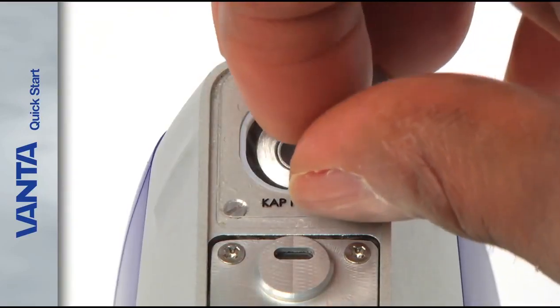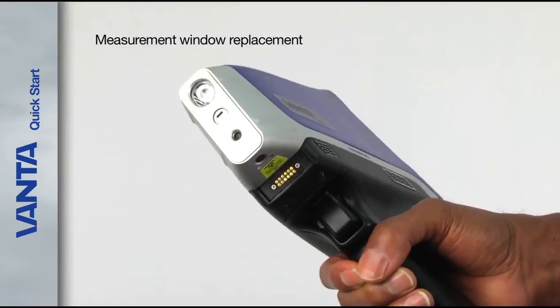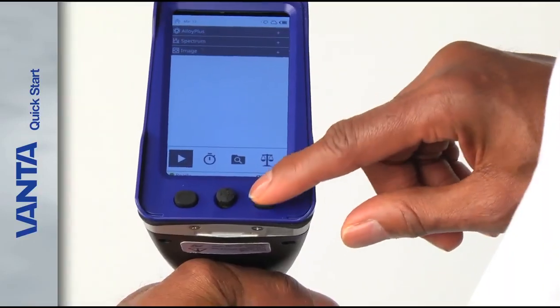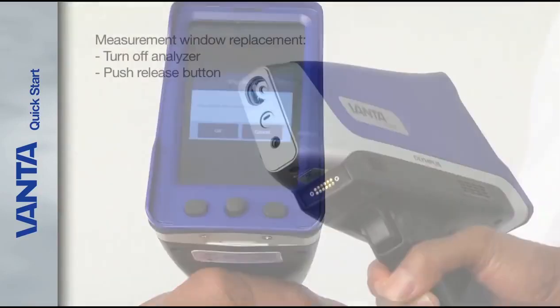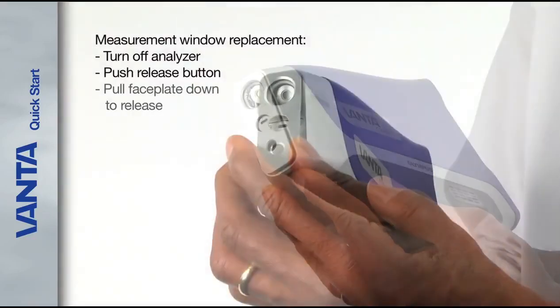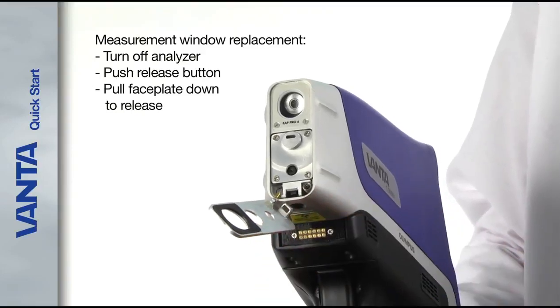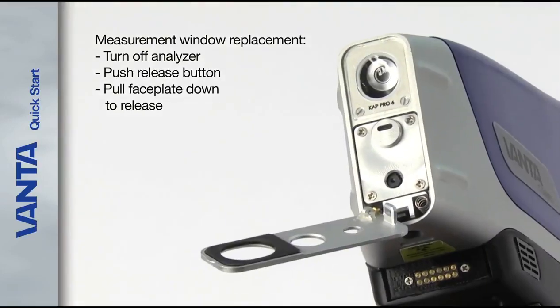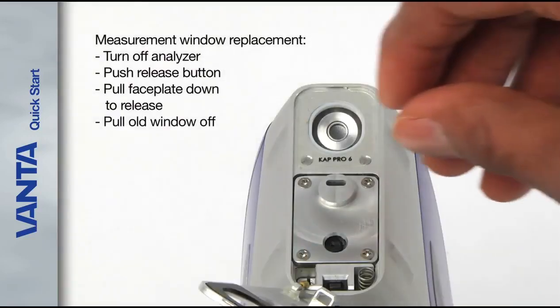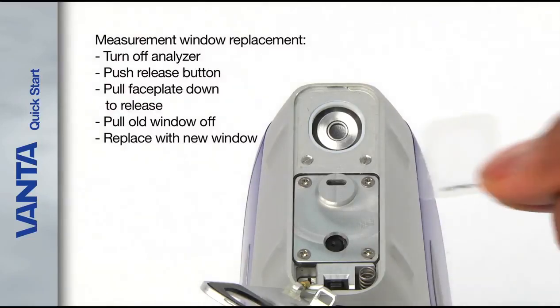Vanta analyzers feature simple measurement window replacement without the need for any tools. To change the Kapton or Prolene measurement window, turn off the Vanta and then firmly push the release button on the bottom of the snout. Pull the faceplate down slightly from the bottom to release the top of the faceplate from the snout assembly. The faceplate swings down to expose the measurement window. Pull the old window off and replace it with a new one.